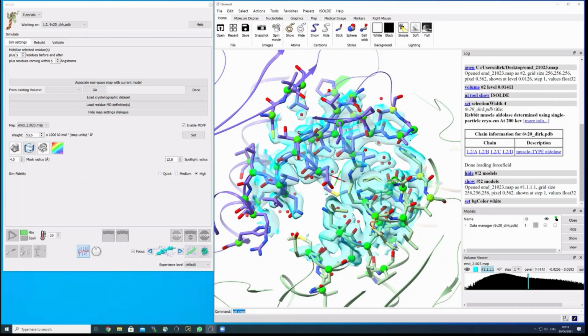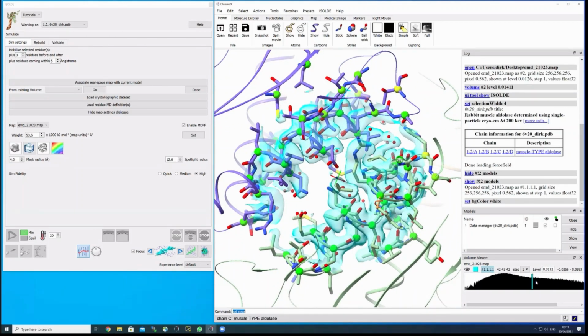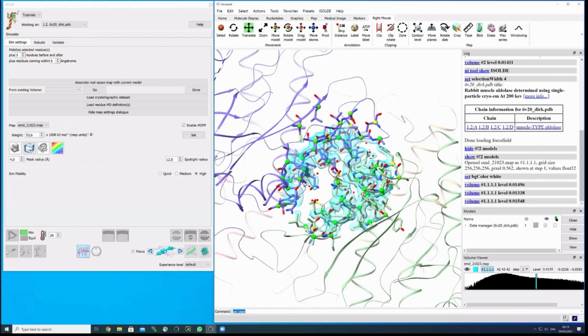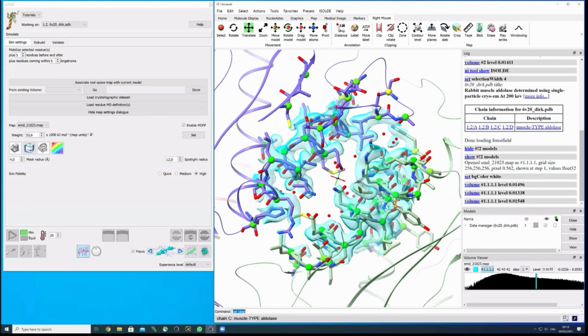And if you now try to move the model, which I can do with the middle mouse button, I don't know how this is with a Mac mouse if you only have two buttons, then the scale bar will reappear. But you can also manually move the model under the right mouse tab in ChimeraX at the very top. You can say, okay, I want to translate, rotate, and then the map should reappear, and then we can use it as before. Now it's connected, and you can change the threshold here. You can also change the step size if you want, but this is typically how you start off. And these are the first steps.